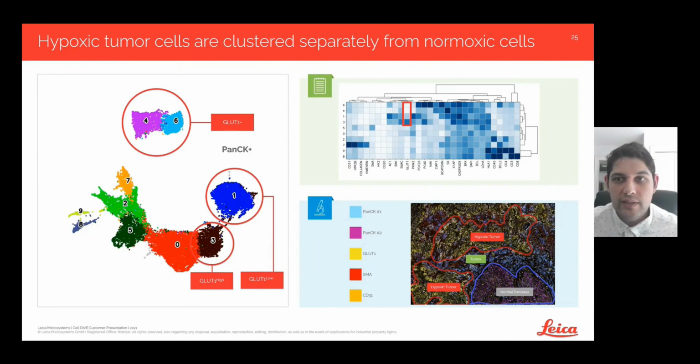So the layering of these dozens of biomarkers can help to identify differences in the tumor cells that are not obvious from just a few biomarkers. And state-of-the-art visualization of data has recently been developed for robust discovery from single-cell sequencing data. And these same algorithms can actually be used to mark biomarker expression and cell relationships using cluster analysis and UMAP.